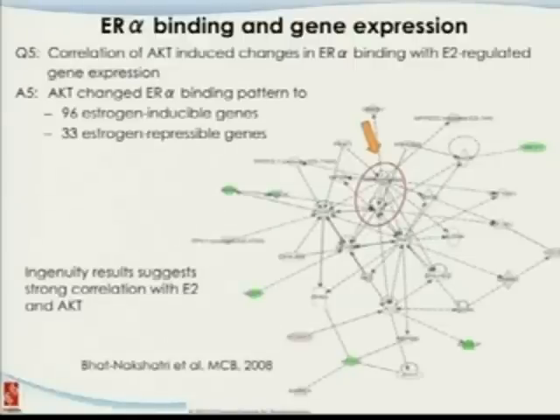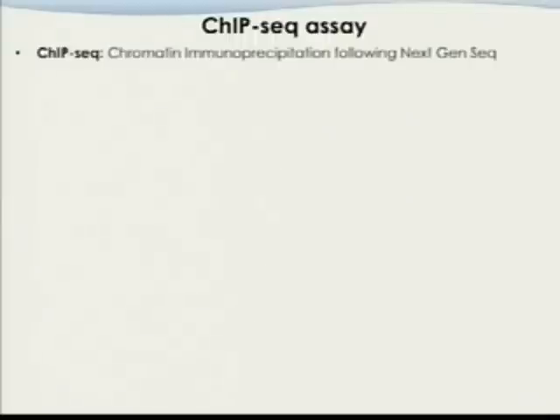So this work was based on the ChIP experiment. The reason I'm talking about this in such great detail for obsolete technology is that most of the things that I'm doing here, we can still do the same thing with the ChIP-seq derived data. All the technologies are still valid and our algorithms are still valid. And some of them we will go through in a little bit more detail in the next lecture.